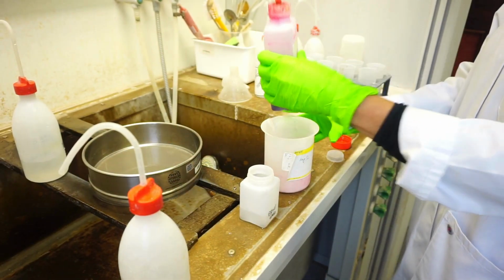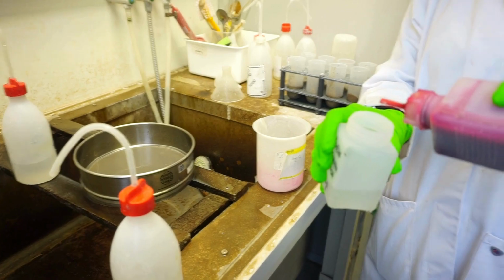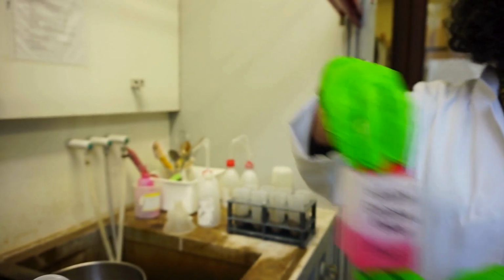A few drops of rose bengal dye are added to color the organic material within the samples and make the recognition of meiofauna easier. The remaining sediment is stored in 4% formaldehyde.